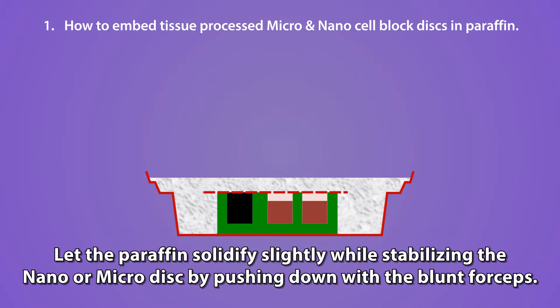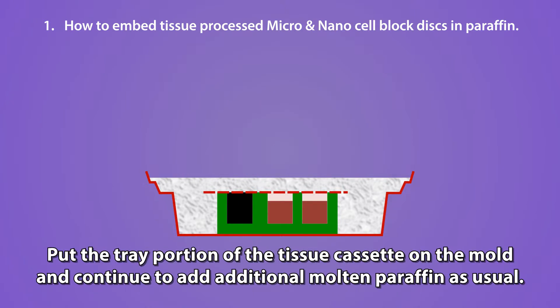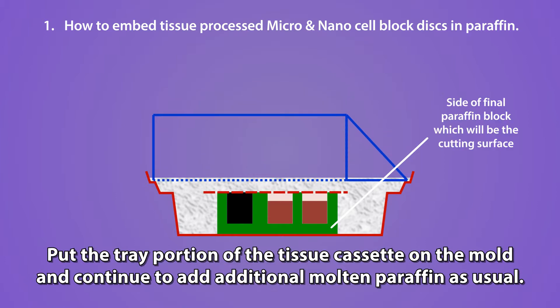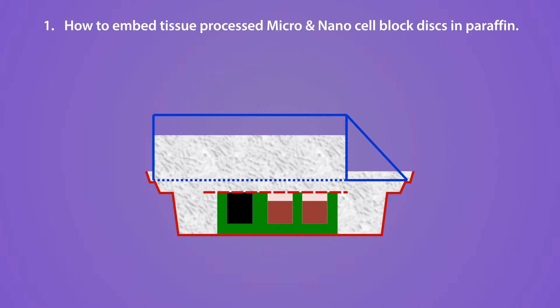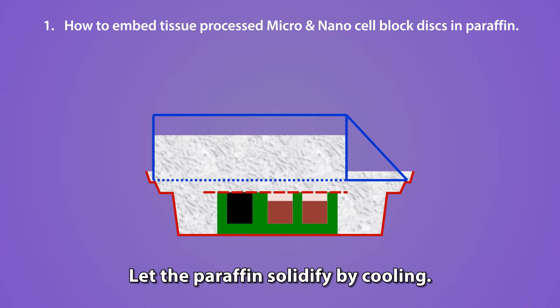Let the paraffin solidify slightly while stabilizing the Nano or Micro Disc by pushing down with blunt forceps. Then put the tray portion of the tissue cassette on the mold and continue to add additional molten paraffin as usual. Let the paraffin solidify by cooling.